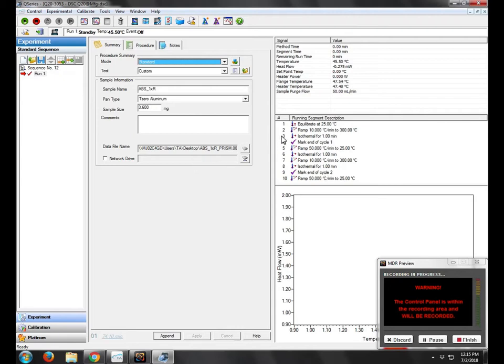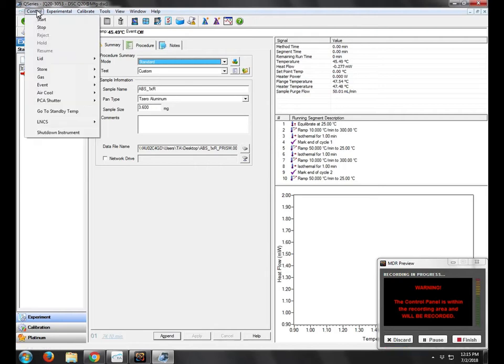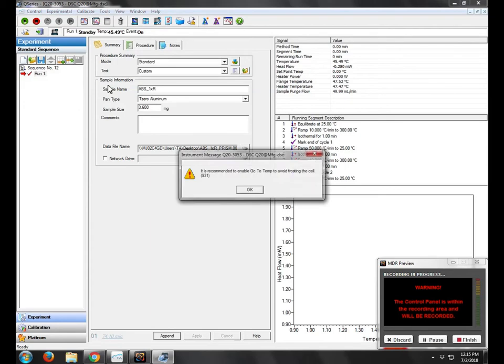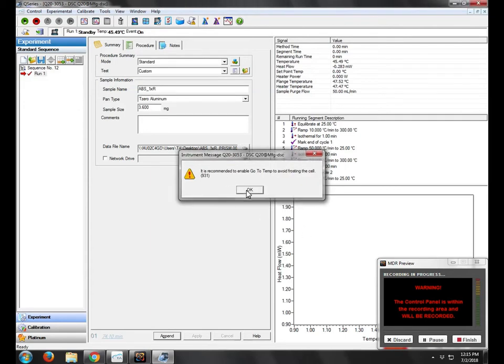Okay, the next thing we're going to do is start the chiller. So under Control, Event, we'll click On. We'll hear the click from the chiller, and then you'll see this pop-up window.